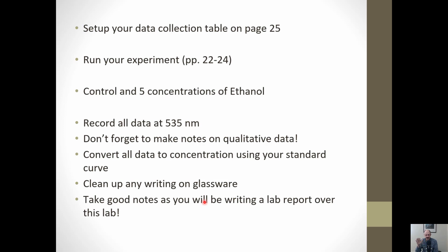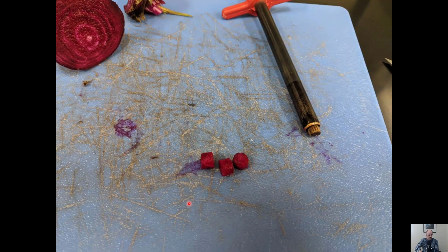When you're done, clean everything up as well as you can, rinse things out, unplug your spectrophotometers, and log off the computers. You don't shut off your computer, but log off. And remember to take really good notes this week, as it's important, as you will eventually be writing a lab report over this lab, in most lab sections at least.